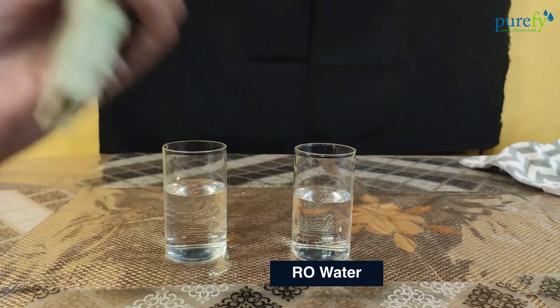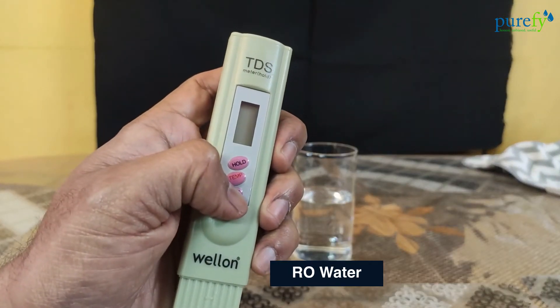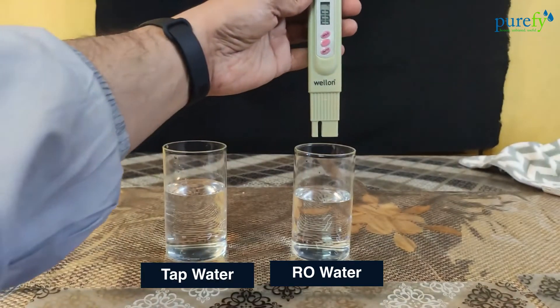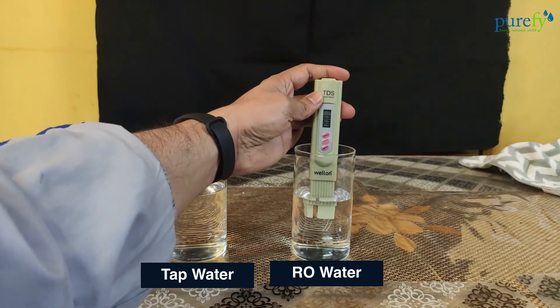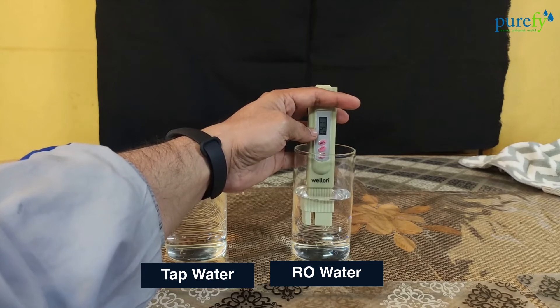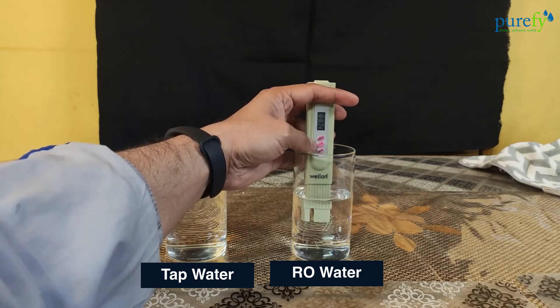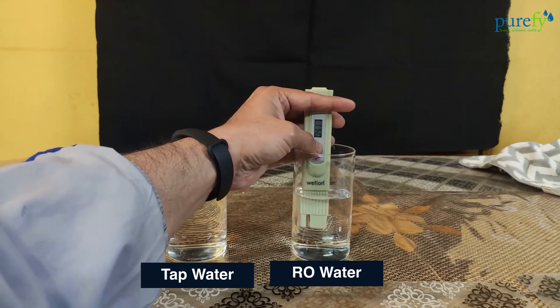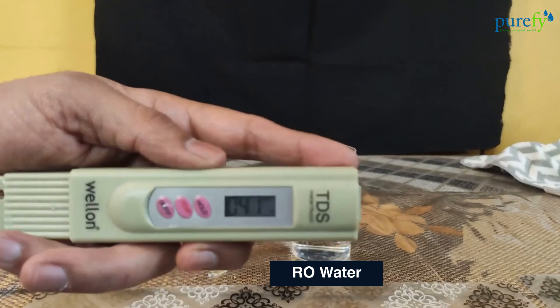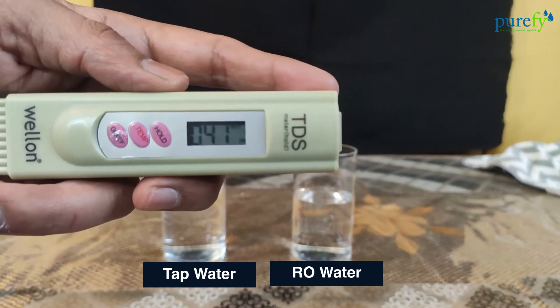Now let's measure the TDS level of the RO purified water. Before you do, shake off the excess water from your meter to make sure no water droplets remain from the previous test. Dip the TDS meter till the maximum level and wait for the reading to stabilize. The reading is stabilized now — let's press the hold button and take it out of the water sample. As you can see, the TDS value of the RO water sample is 41 ppm, which means our RO purifier has done quite a good job of purifying unsafe, high-TDS water into safe drinking water.